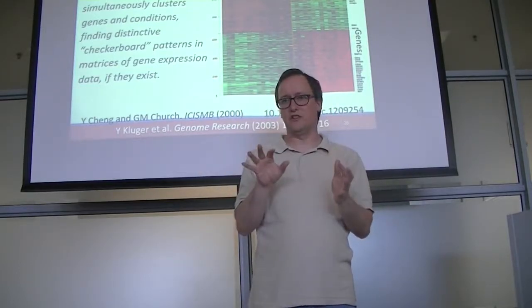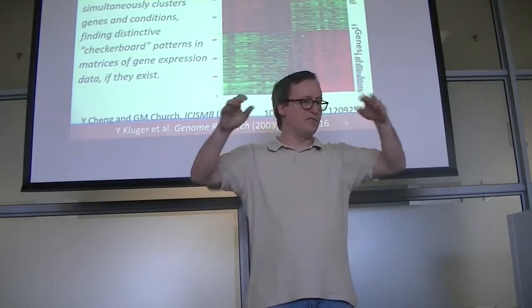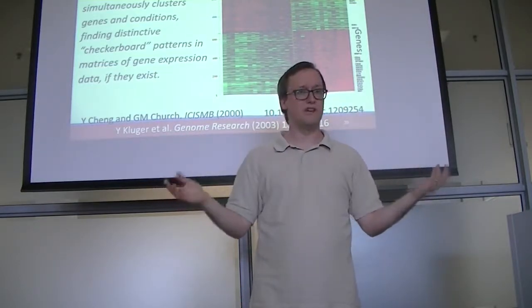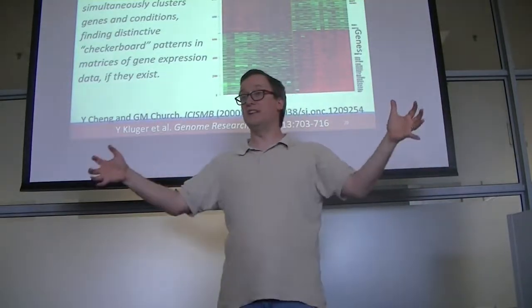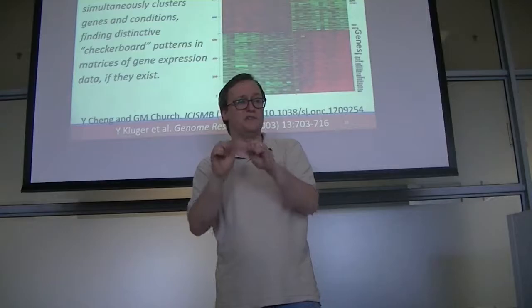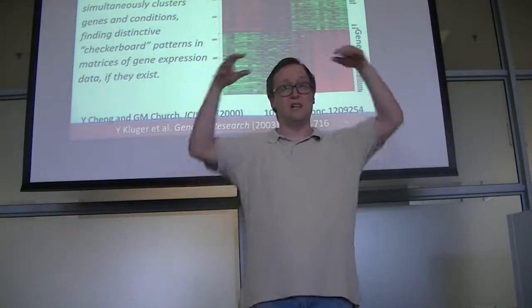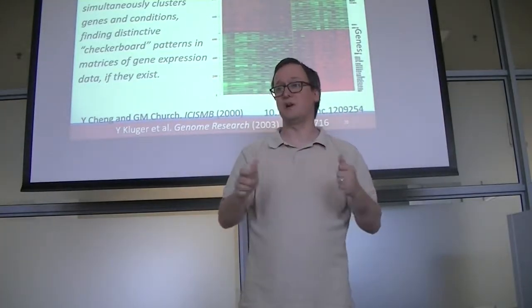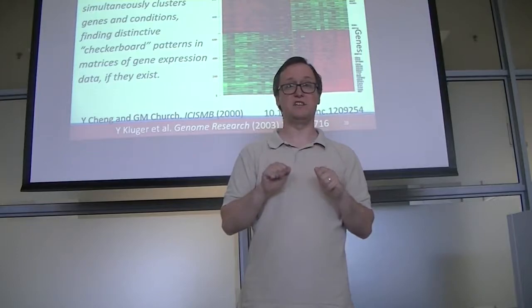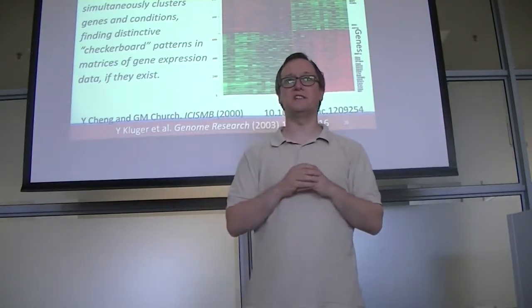two sets of relationships. The first relationship is that we have all these different people that we did microarrays on or that we did RNA Seq upon. Some of these people have very similar gene expression profiles. Some have very dissimilar gene expression profiles. So you can cluster together people based on how similar their gene expressions are. Everyone sees that?